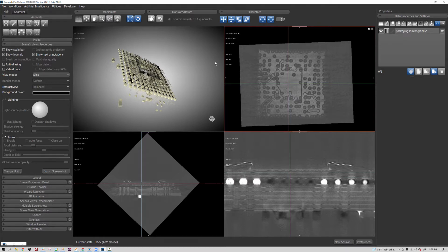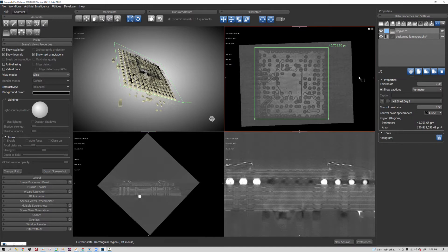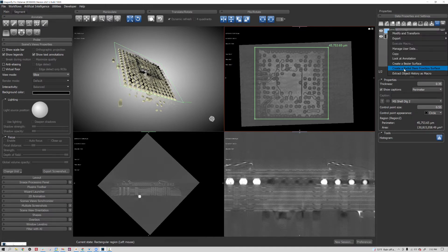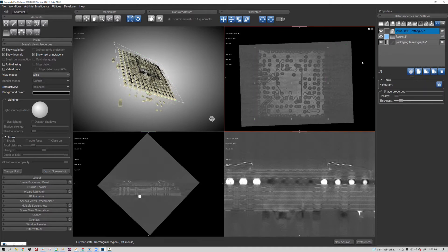Starting with the annotate rectangle here, I can just define an initial rectangle on some 2D plane. Once you have that region, you can right-click and ask for a radial basis surface function. This object itself is going to create a non-planar, distortable plane.